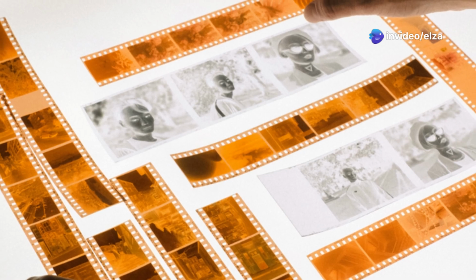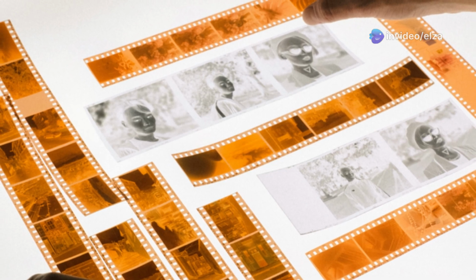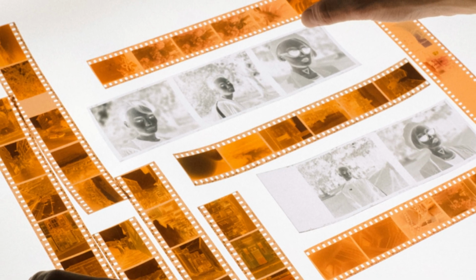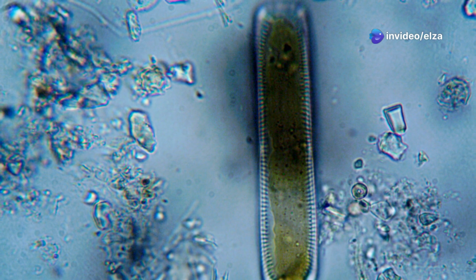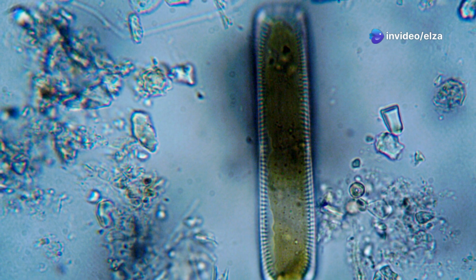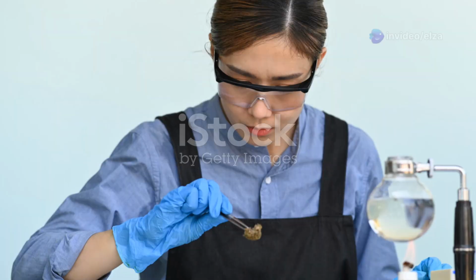Finally, the exposed emulsion is developed, converting the latent image into a visible one. The areas where the radioactive isotopes were present appear as dark spots or grains. These spots provide a visual representation of the distribution of the radioactive substance within the specimen.